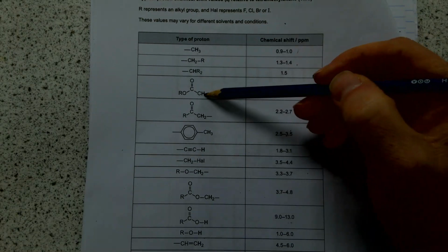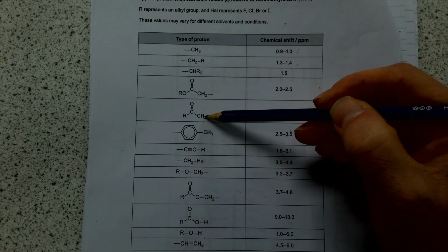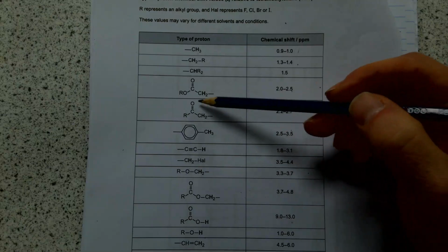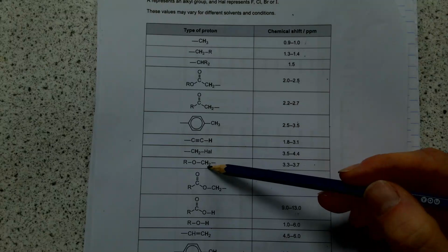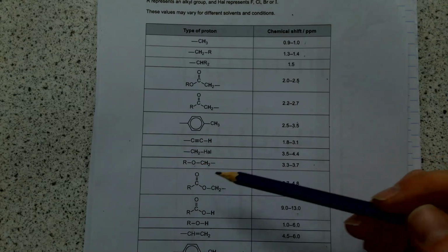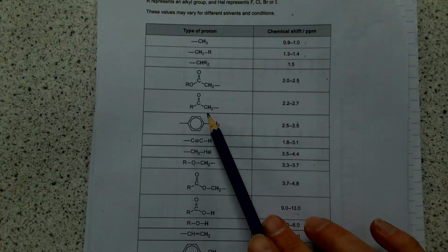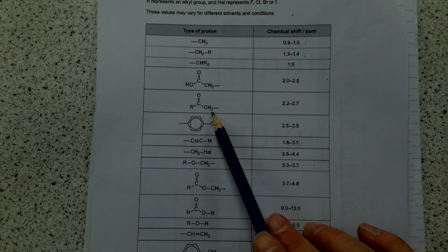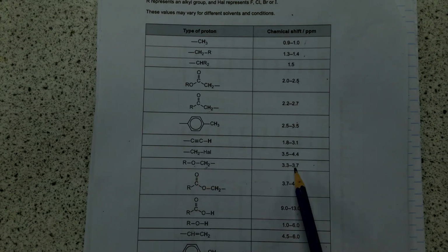But notice this CH2 is next to the carbon of an ester. This CH2 is next to the carbon of a carbonyl, so aldehyde or ketone. This CH2 is next to an oxygen, which means it's an ether. Something I would just raise there, if I could just get everyone's attention here for a second, please. Those CH2s there imply that this is only true if it's a CH2. If there was a CH3 ether, it would have a very, very similar chemical shift.